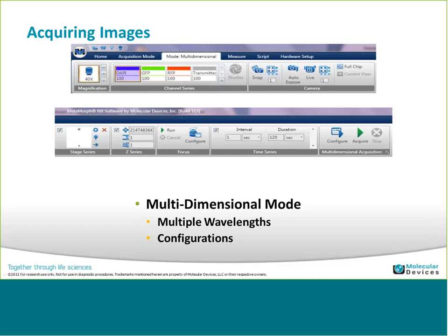And then the next box is your focus, autofocus controls. If you're doing a software autofocus, you're setting up the configurations for that as far as the type of autofocus you're running, the algorithm you're using, and the range that you want to do the autofocus over. Additionally, if you have a hardware autofocus control, those buttons will show up. So if I had a ZDC configured, the one-shot as well as the continuous autofocus options will show up in this section here as well.